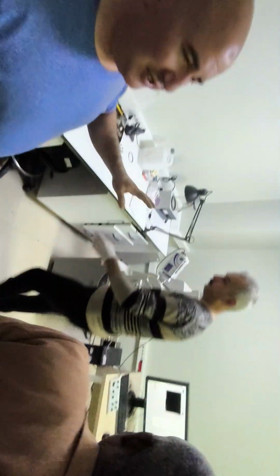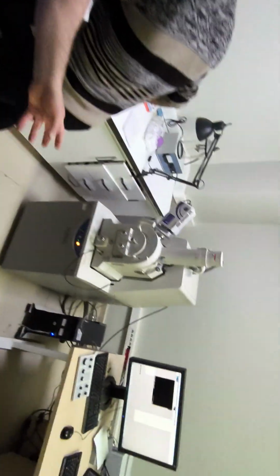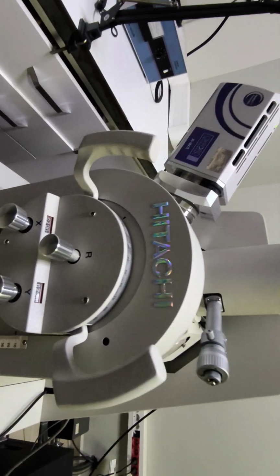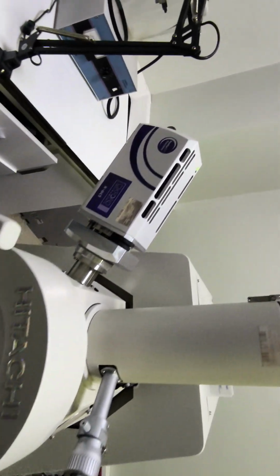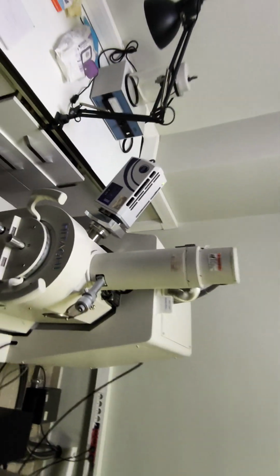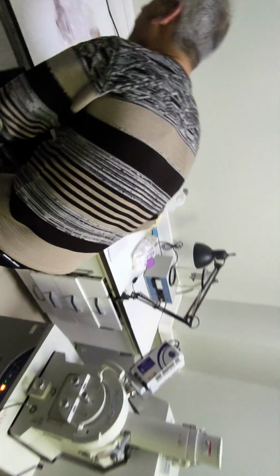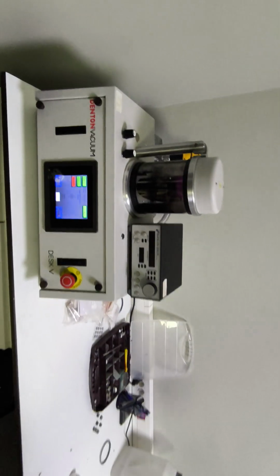Our scanning electron microscope. We can go up to 10,000 or 20,000 magnification. And we also have EDX, energy dispersive analysis.